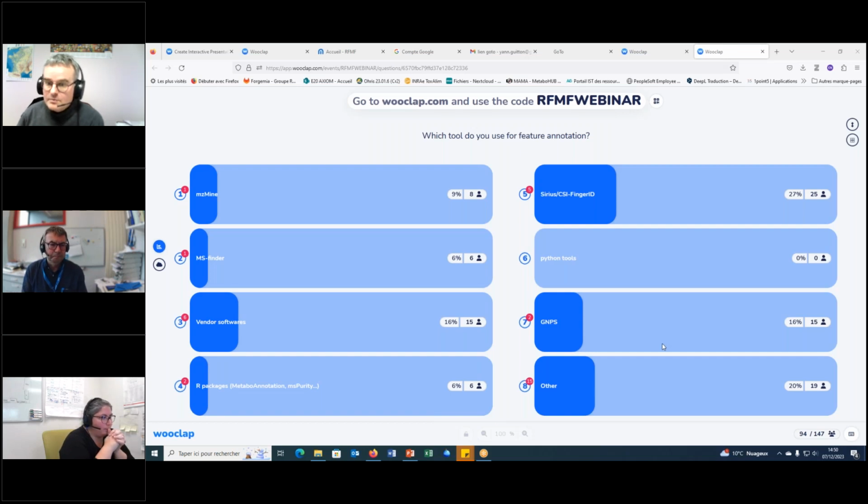No, they are not commonly used indicators, not yet, but some tools are giving some scores to MSMS spectra.